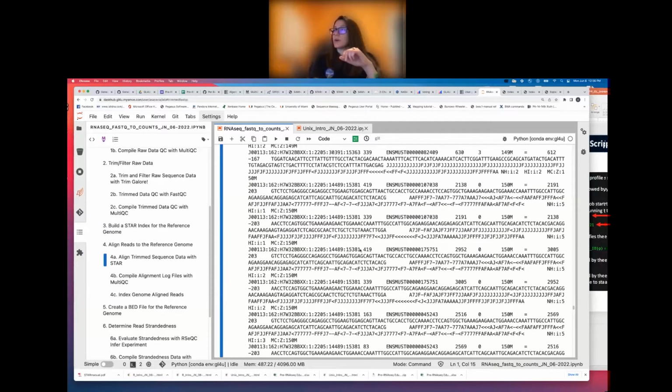And then just below that, on line 7 here, we have again the same exact address, right? The same cluster location. And this one is again template length of 203 in the positive orientation with respect to the reference. So this read here is going to be the same as this read here. And then just below that, again, has the same address, the same cluster location, and the same template length, but this time in the opposite direction. So again, mate pair, and this read here is the same one as this read here.